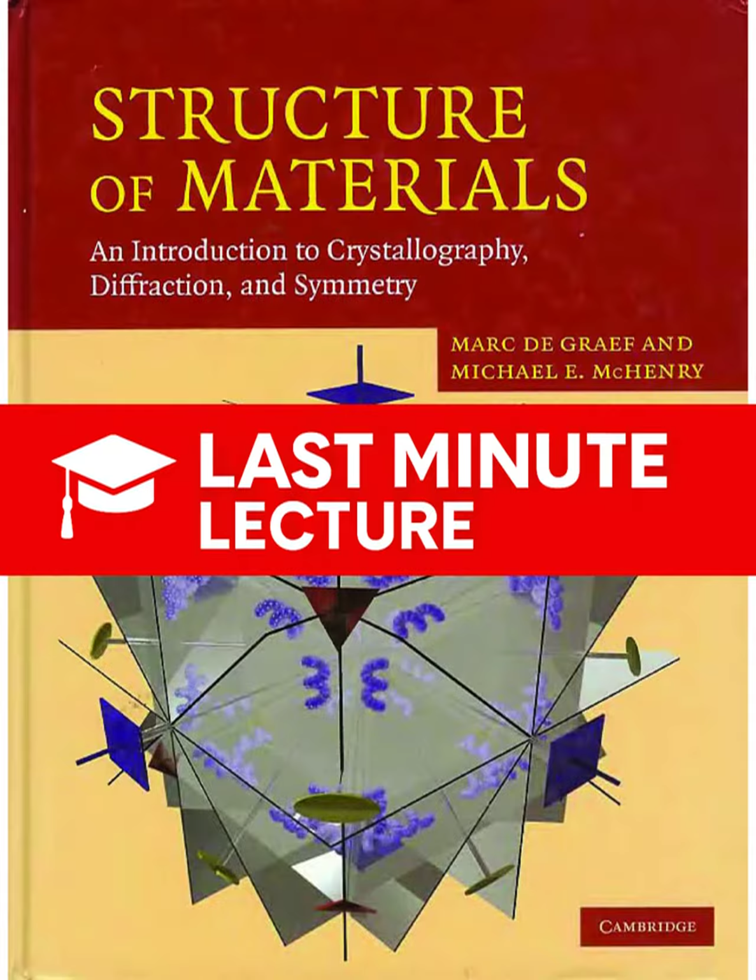That brings us to our final provocative thought for you, the learner. We know the limiting sphere dictates resolution based on that radius, 2 over lambda. Now imagine a researcher is trying to determine the structure of a novel material that has extremely compact, small lattice parameters. So that would mean very large reciprocal lattice vectors, G. Very large. And they find that their standard copper source is physically incapable of resolving the structure because the points they need to see are outside the limiting sphere. So what is the practical, real-world upgrade they have to save up for? And why does it solve this problem of the limiting sphere?